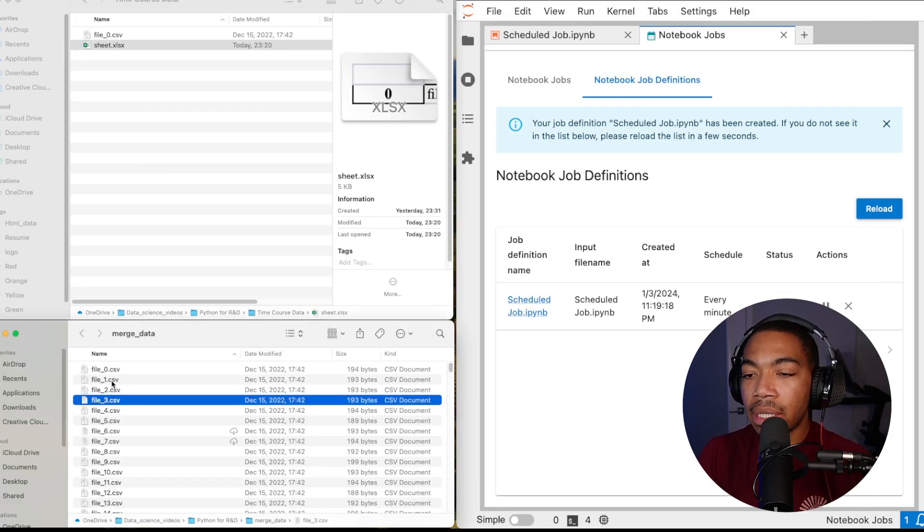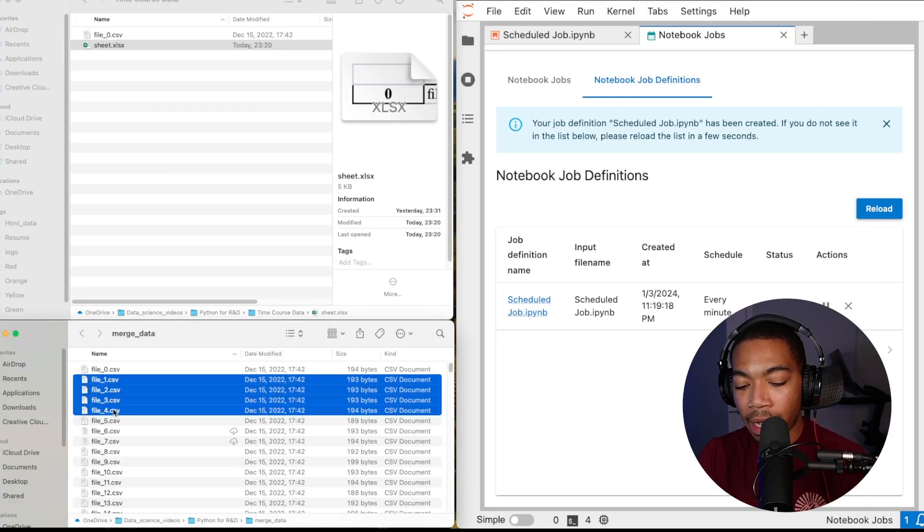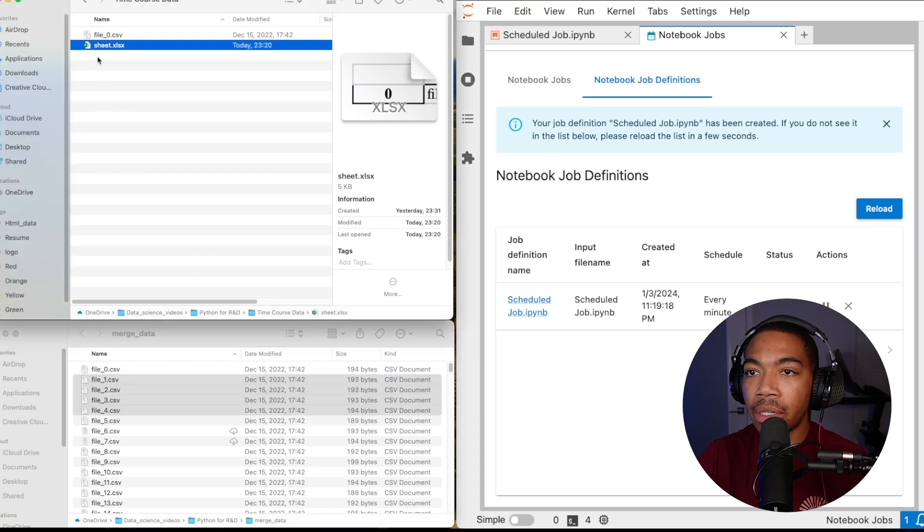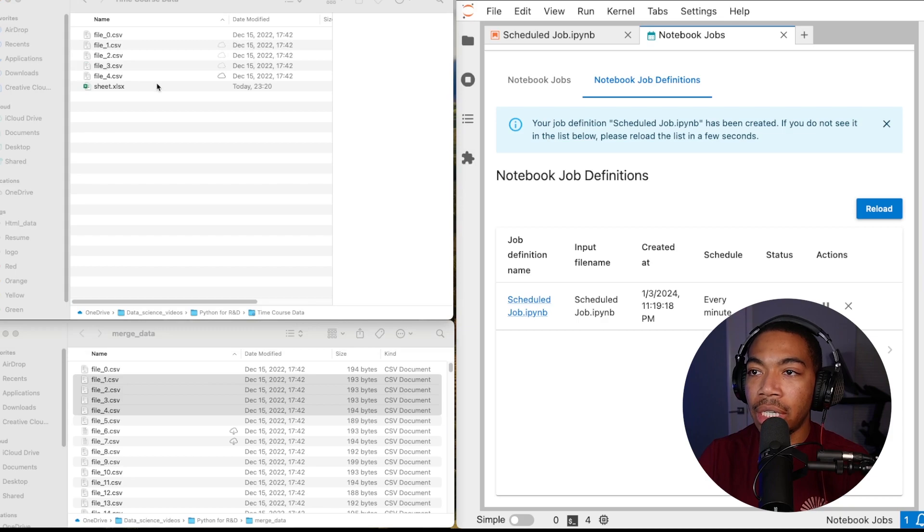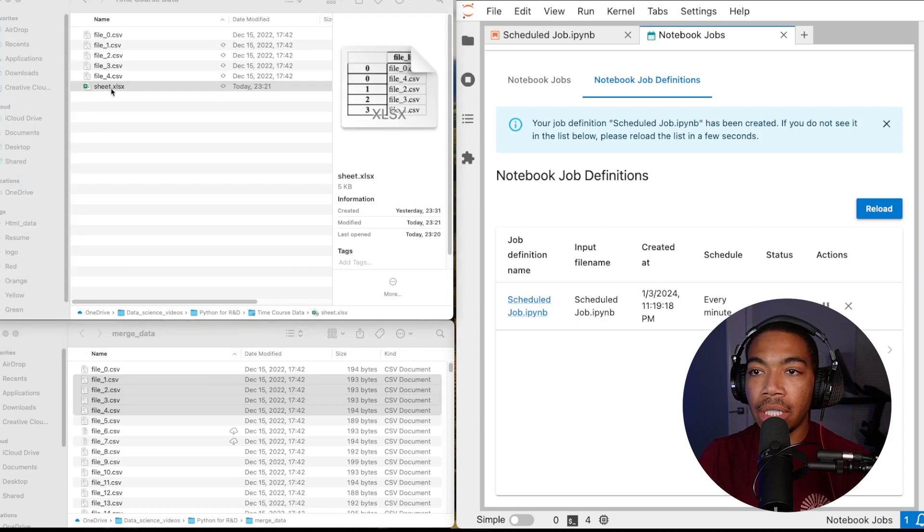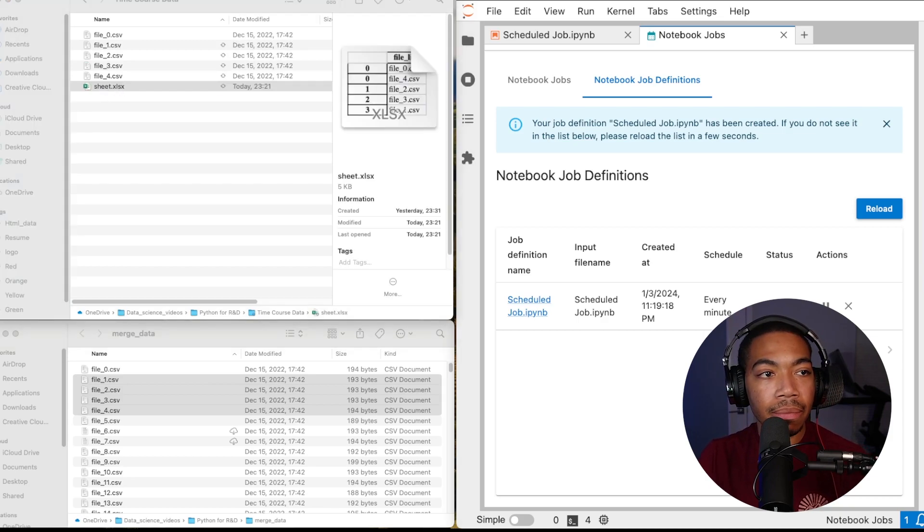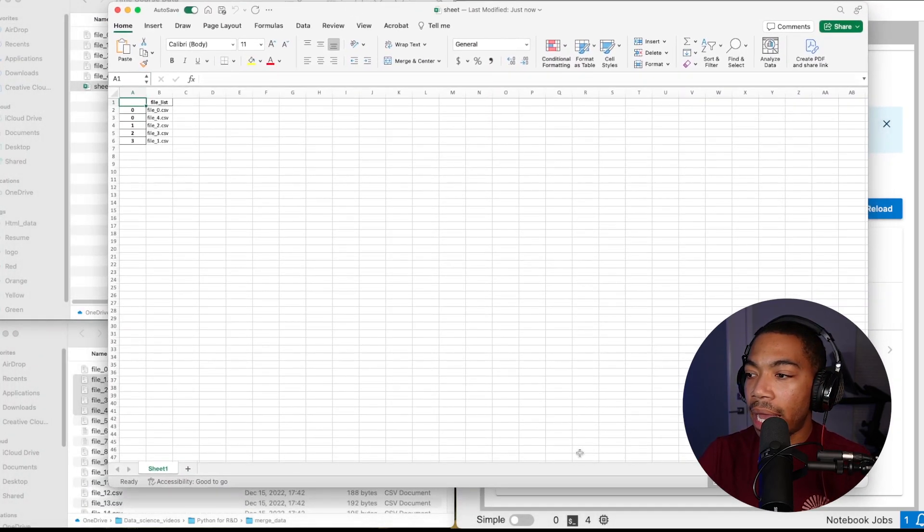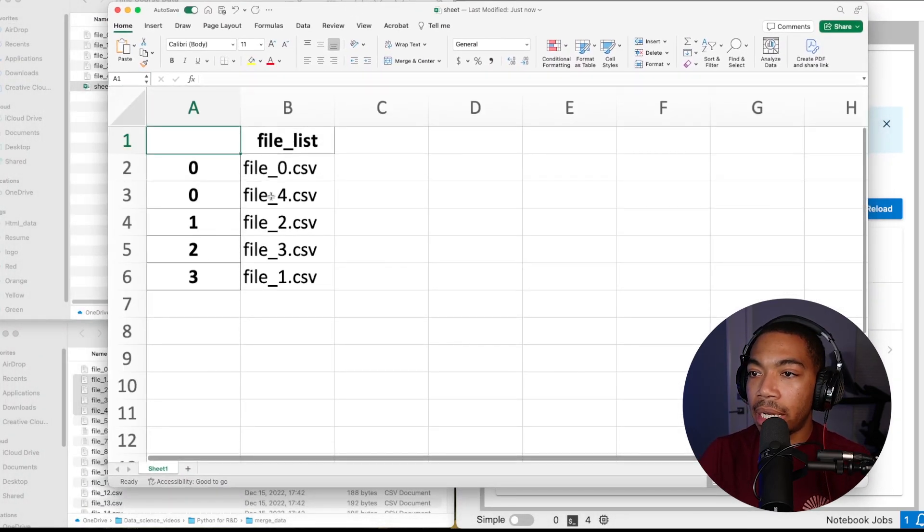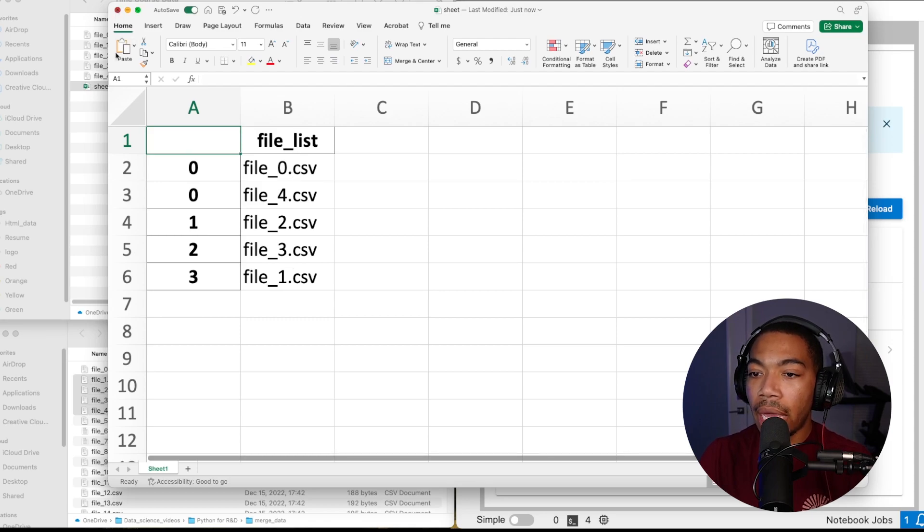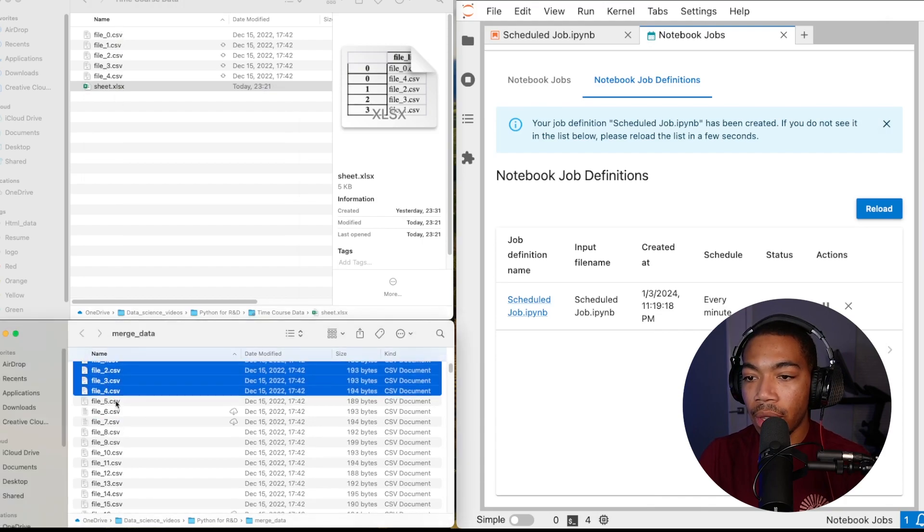So what I want to do is simulate data streaming in. So let me copy a few files from this merge data folder and add them to our sheet. So there we have it. Let's look at our sheet again and now we have our updated file list, files zero through four. And let's just do this one more time just to ensure that this works.